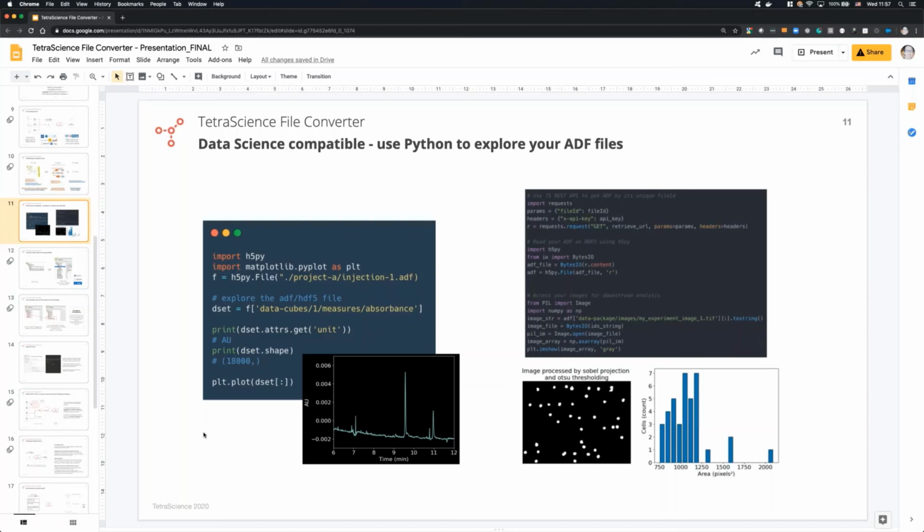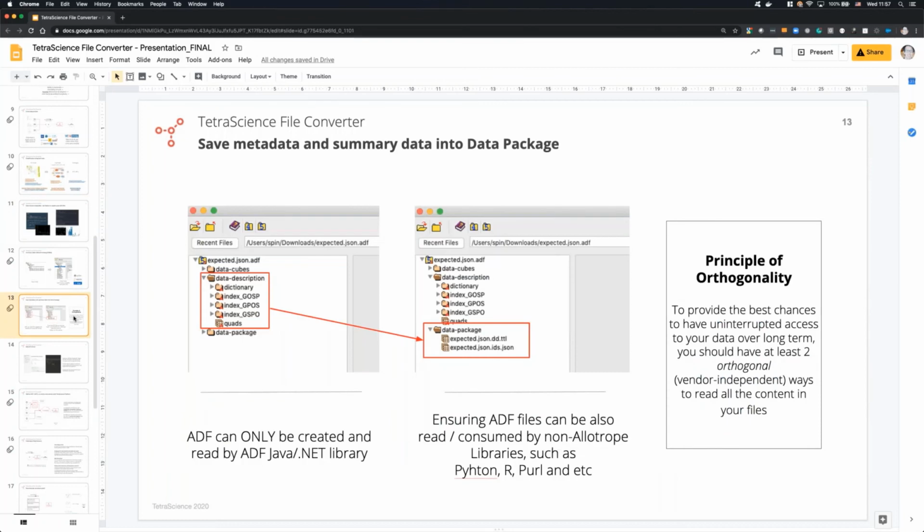He put out there that if other files are written that conform to the standard, then they can be read into that viewer as well. So the notion of this consistency and interoperability is a really important component of the strategy of developing the ADF libraries.